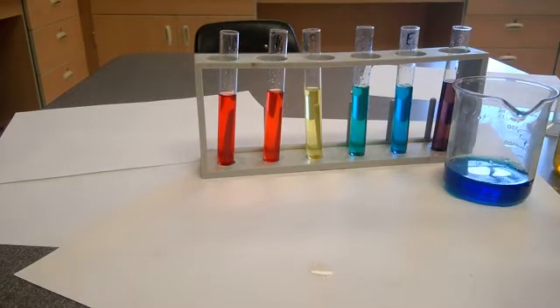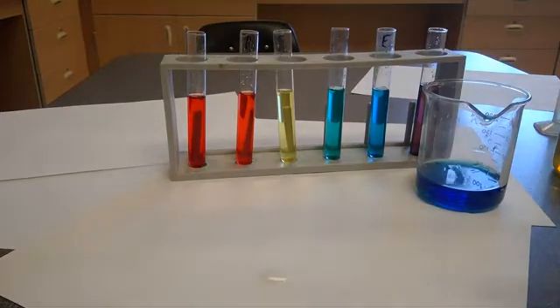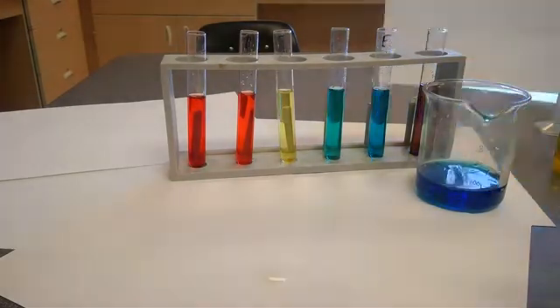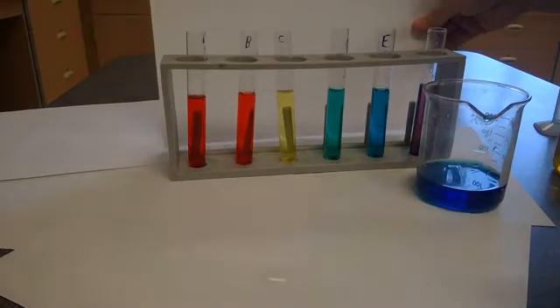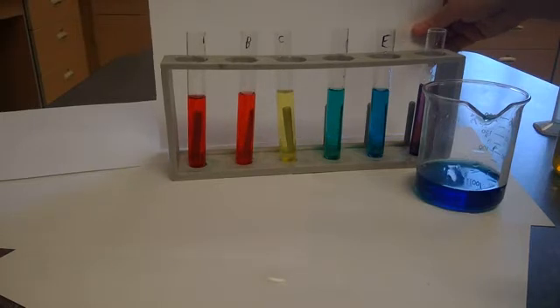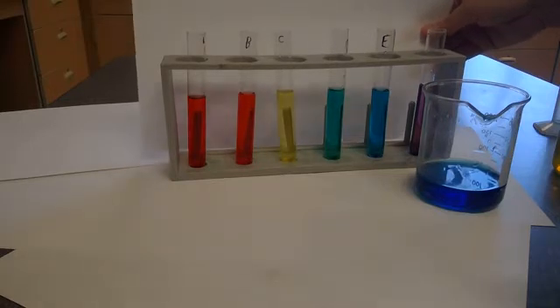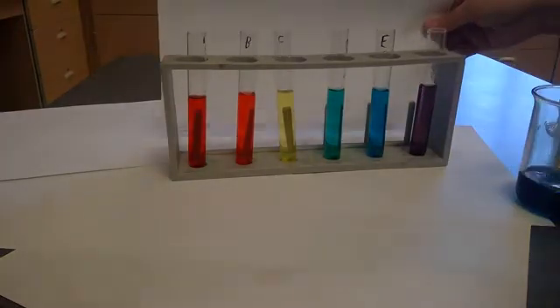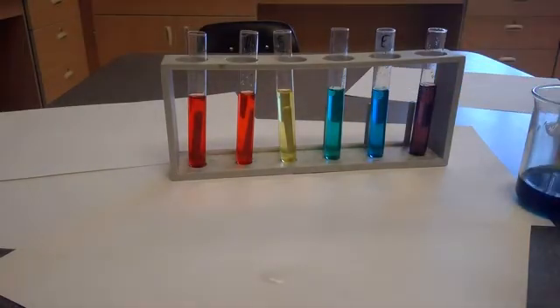All right, so taking a look at this, so we've got a nice rich red, and next to that red, you can see it a little bit better, is a nice shade of orange. Then I have yellow, followed by green and blue. So I can see that those colors are just a tiny bit off on the video, but it's definitely some nice shades of those colors. Oh, sorry, and of course that rich purple on the end. So again, I've got quite the rainbow going here. So that was actually what we wanted.